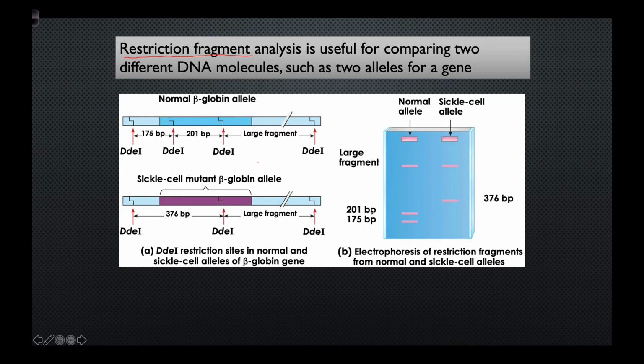Well, if we look at the gel electrophoresis that was done by ultimately inserting both of those samples of DNA, this one here went to this well, and this one here went to this well. We turn on the gel electrophoresis unit. We shut it off after a given amount of time. And what we found was 3 different fragments for this strip of DNA right here. And if you look at the 3 fragments that it found and that it separated, it was this one here, and this one here. Okay?